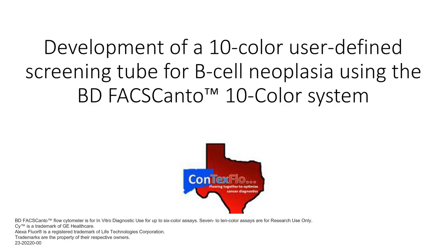Frankly, many of these reagents we've been using for years, and we have a lot of familiarity with them and experience. Knowing the patterns of normal antigen expression is really the best way, I think, to verify that you're getting appropriate staining, positive and negative.